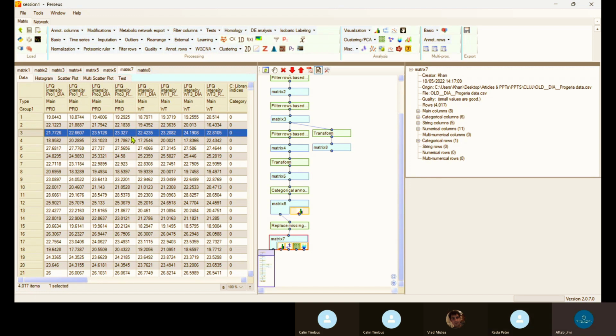If there are 2 or 3 missing values, then it is okay, because it takes the average, and in the minimum method it arranges the values of the sample in decreasing order and takes one quantile of the lowest values. So it is logically correct that it fills the values from its own samples. But if you have only 1 or 2 samples, then filling the missing value creates some bias. So we have to remove those rows also.